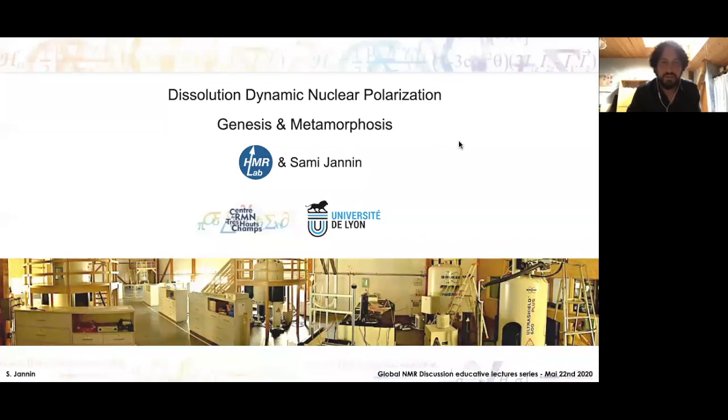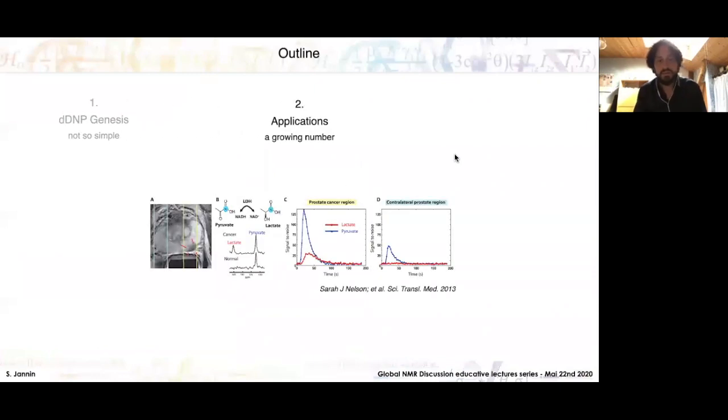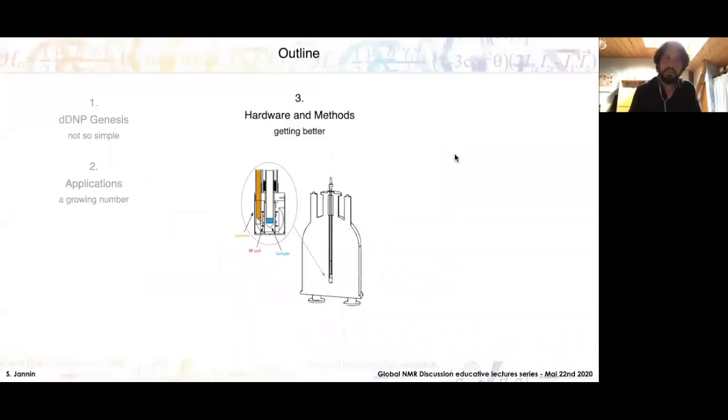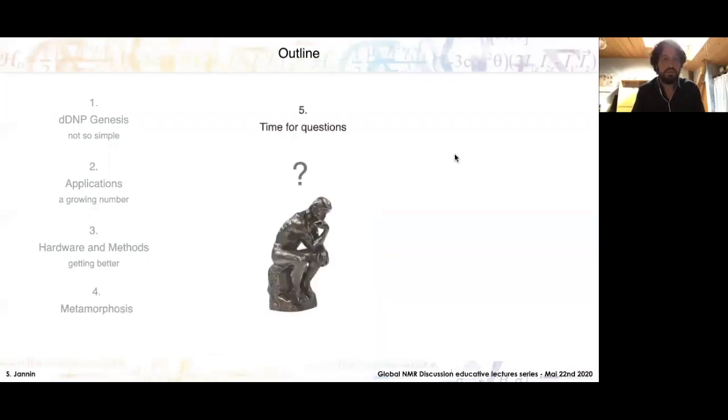Okay, so here's the outline. We'll talk about the genesis of dissolution DNP, and we'll see that it's actually not so simple. We'll review a limited number of applications. We'll talk about hardware and methods. And then we'll talk about new developments in dissolution DNP, and at the end we'll have plenty of time for questions.